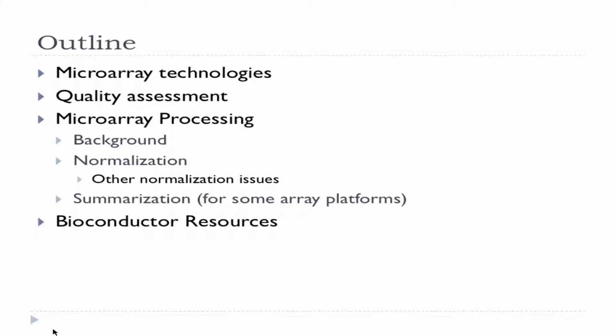Each of the different microarray technologies has, I won't say strengths and weaknesses, but features that are different from one technology to the next. Different control probes, for example. Certainly different assay techniques. Different scanners to do the scanning of the microarrays to get the expression values, etc. And we're going to look a little bit at quality assessment. You guys have already done some of this in Naomi's exploratory data analysis lab, so a lot of this will be sort of review.